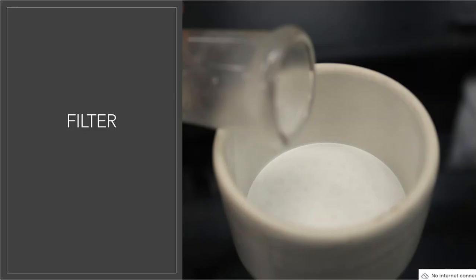Okay, so like any person, I decided to filter that solution through the Buchner funnel after I seated the filter paper. Now, seated, maybe it's the accent here. It's seat, S-E-A-T, not seed, S-E-E-D. I'm not seeding the filter paper. I'm seating the filter paper.